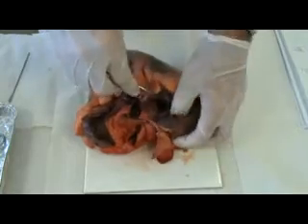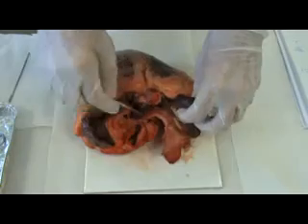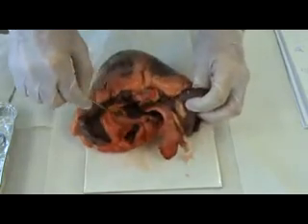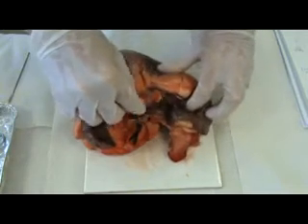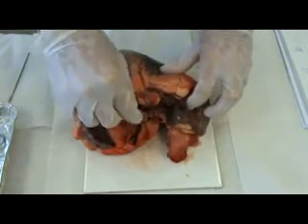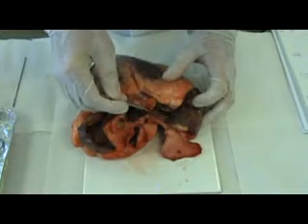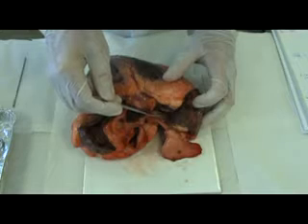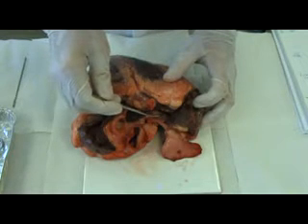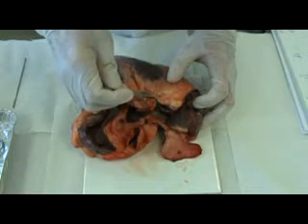pulmonary. So look here, this section there. We've got a vessel quite close to the aorta over there. This is the pulmonary vein. It's carrying blood from the lungs back to the heart, so it's rich in oxygen, and it's carrying oxygenated blood into the left atrium.